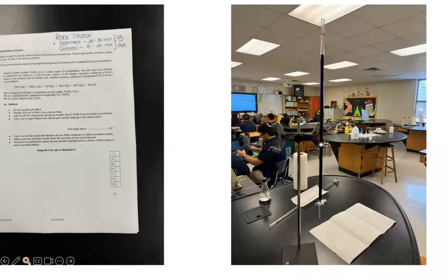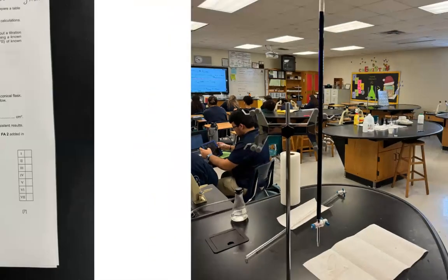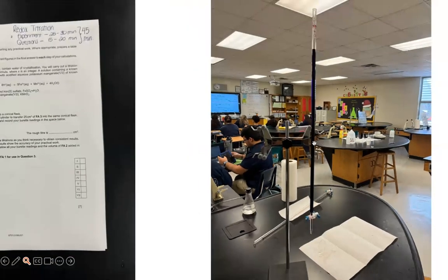So burette clamps, the way that they work is that you put your fingers in these little holsters over here. You push down, and that will create a little opening that you can put the burette in, and then you release to make it clamp onto the burette. You can adjust the height either by unscrewing this thing over here and moving it down the ring stand, or you can just squeeze these, move the burette physically down, and then release.